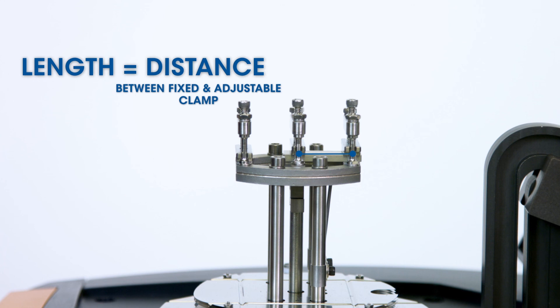For testing shorter samples, you can always select and install a smaller size single cantilever clamp.